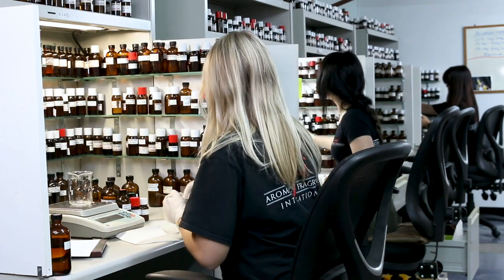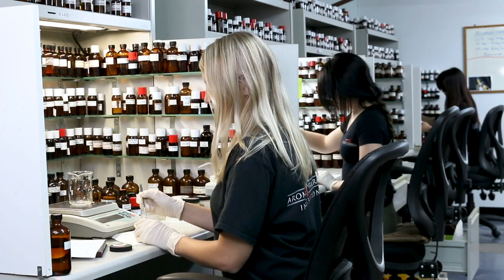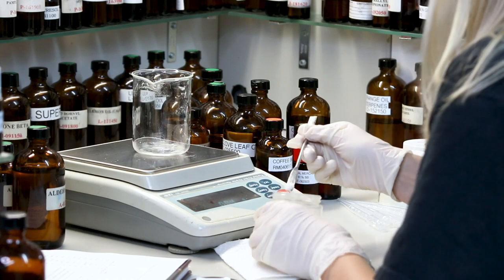Before we started, we weighed the beaker, so when we're done we can check our weight. This is a 100 gram formula. We're going to start off with the crystals.